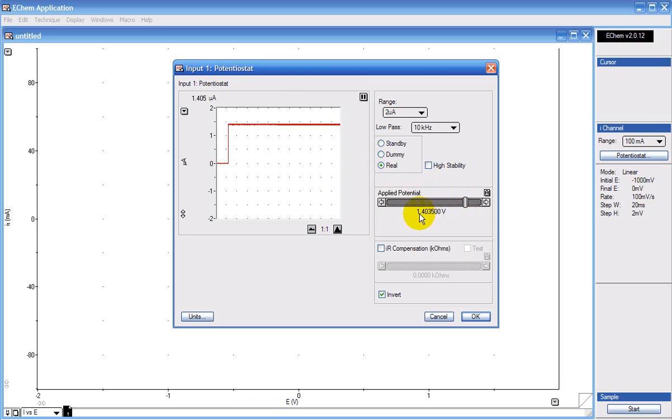Here I've applied 1.4 volts and I'm recording 1.4 microamps. So for a 1Mohm resistor this is correct. This is what you'd expect.